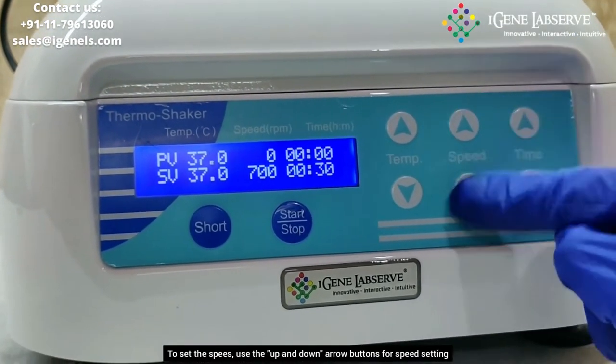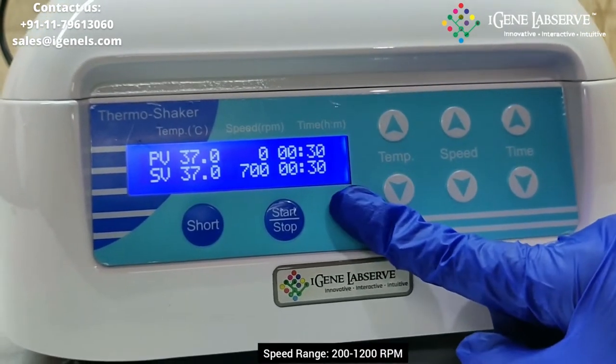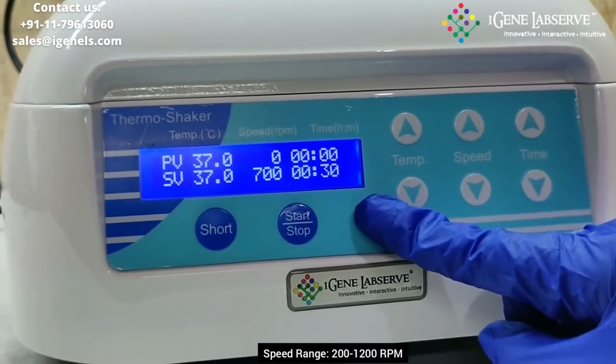To set the speed, you have to use these 2 arrow keys to increase or decrease the RPM. The RPM ranges from 200 to 1200.